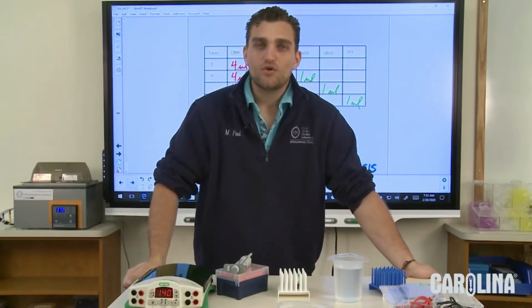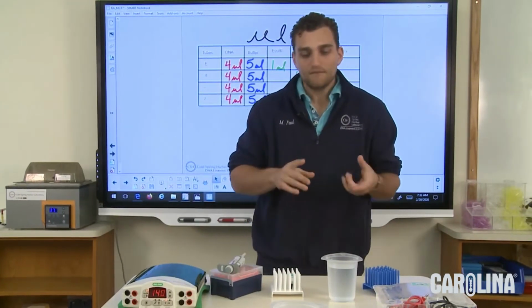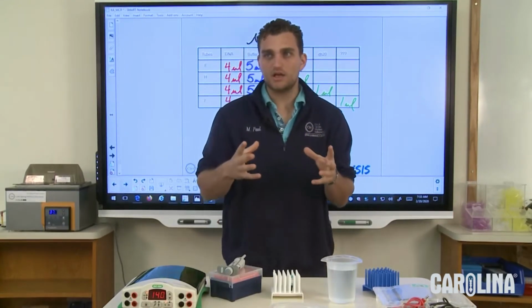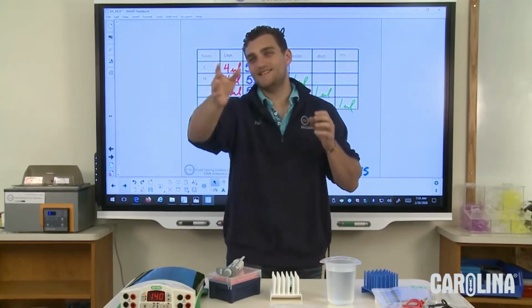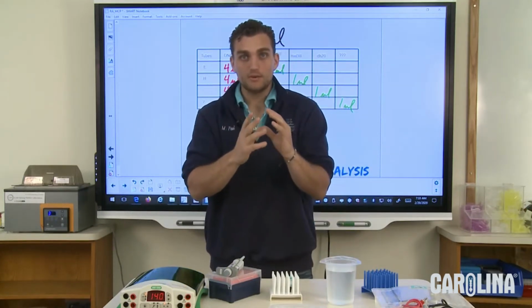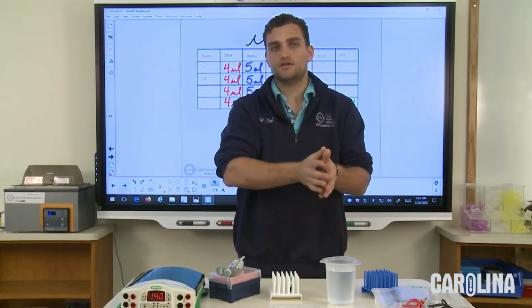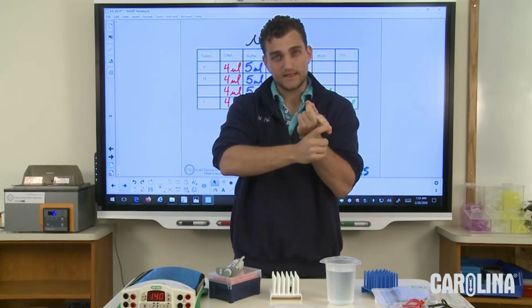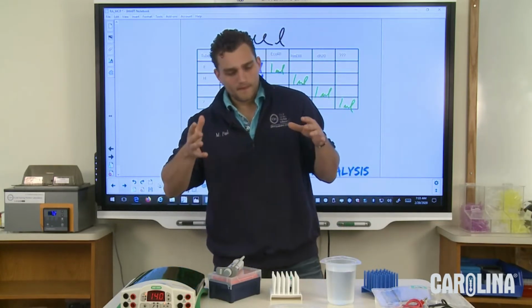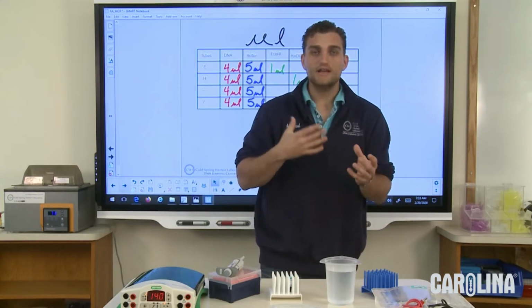Now, there's a couple of interesting things that we need to do. First thing, we're cutting DNA, correct? So we're going to be cutting DNA. Now, well, yes, PCR can let us see, definitely. But what we're going to do is cut DNA, and we want to make sure that we can see that we're cutting it in the right area. So we're going to have to, one, use a tool to see the DNA, two, use a tool to separate out the DNA. Now, DNA is clear and colorless, right? So it's colorless. What I need to do is give it some color.